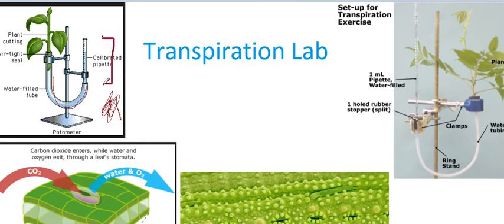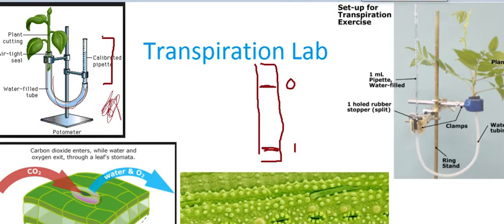That calibrated pipette has a total of 1 milliliter, and I feel compelled to make sure we understand the nature of that pipette. Towards the top, it said 0, and down towards the bottom, it said 1. So the region in between those, which I've shaded in yellow, accounts for 1 milliliter of water. So that's how the tube works.